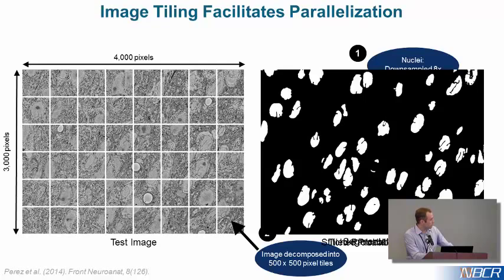So here is, for example, the probability map for those nuclei. You can see the correspondence. Nuclei are probably the easiest thing to segment in these data sets. They're very big, they're very regular. We get very good results. Then there's the stitching, and some filtering, which we'll discuss again in the second session, to get you down to the segmentation.